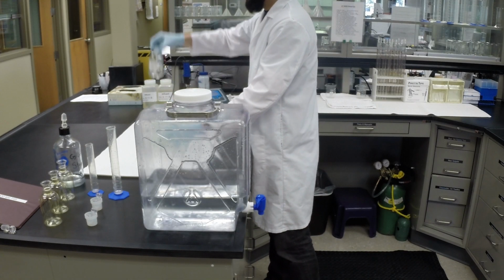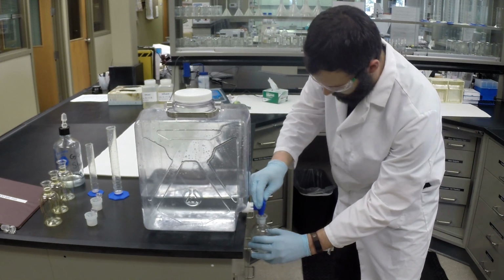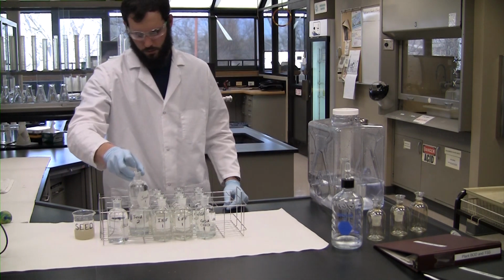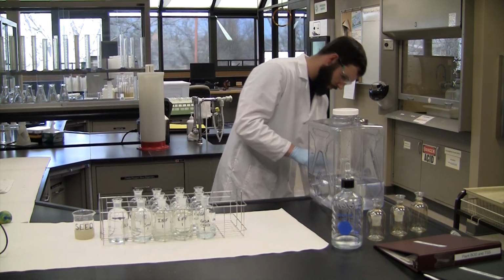Top off each bottle with dilution water. Pour your dilution water slowly into the bottles up to the neck. Make sure not to overflow the bottle. Do this to all the bottles in order and place the bottles back into the BOD rack. Once all of the bottles are full up to the neck, you are ready to read out your initial DO.